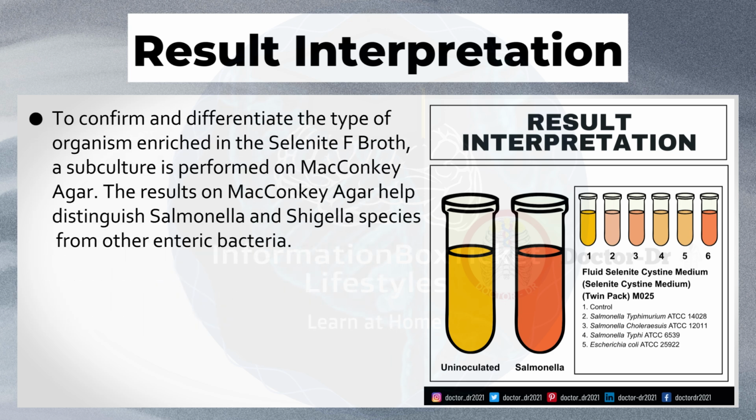To confirm and differentiate the type of organism enriched in the Selenite F broth, a subculture is performed on MacConkey agar. The results on MacConkey agar help distinguish Salmonella and Shigella species from other enteric bacteria.